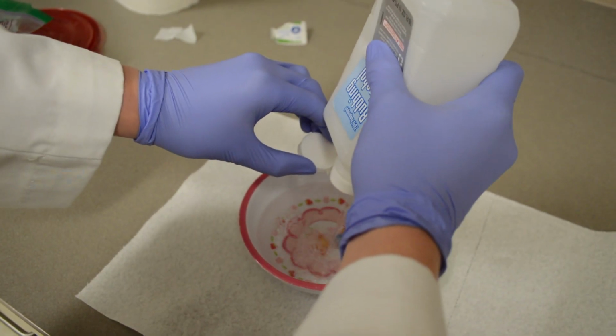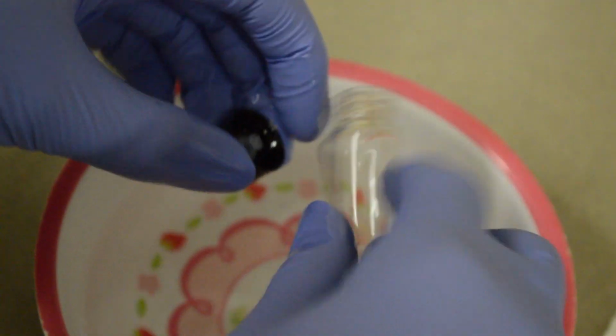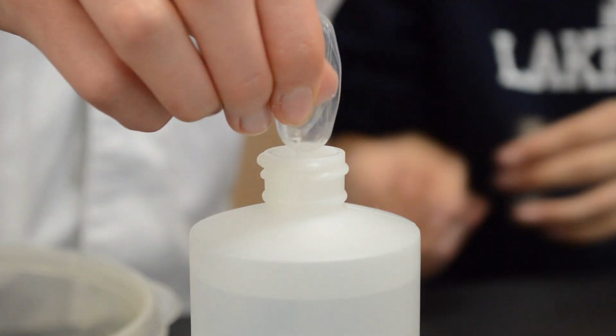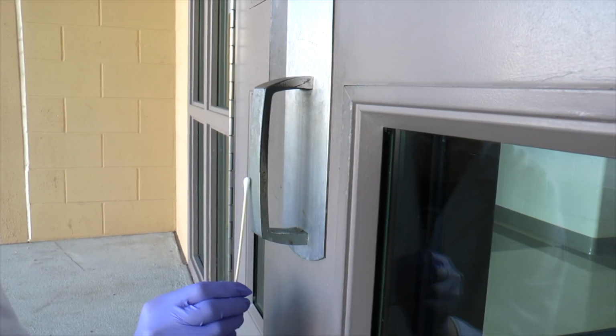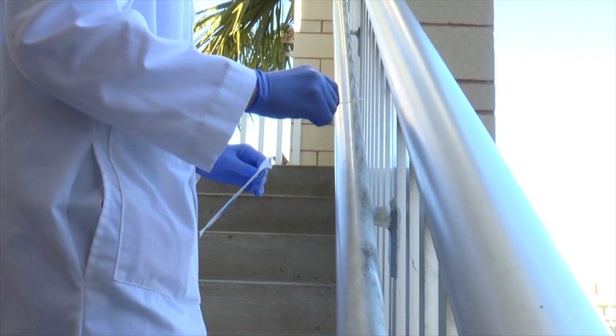The first thing we're going to do here is sterilize our glass vials, which we will use to store our swabs. We want to make sure everything is sterile to avoid contamination that prevents us from stating that the bacteria we see is really from the school and not from somewhere like my hands. We're going to fill these vials with 2 milliliters of sterile saline to keep the cells that we sample happy and healthy. After we've prepared our vials, the next thing we're going to do is collect our samples. For this test, we swabbed the school's doors, toilet seats, bathroom sinks, computer keyboards, trash cans, and stair railings.